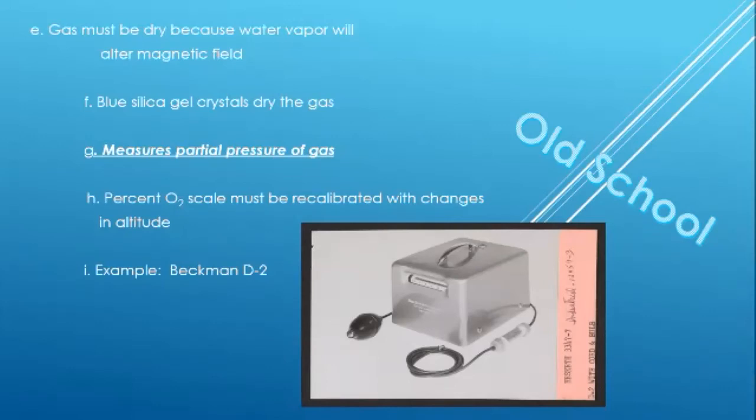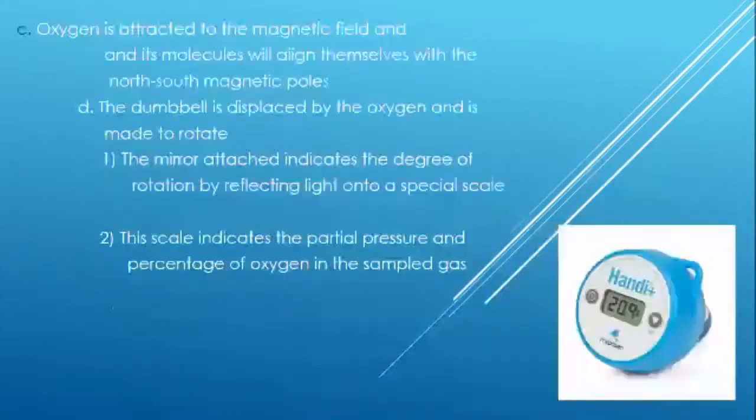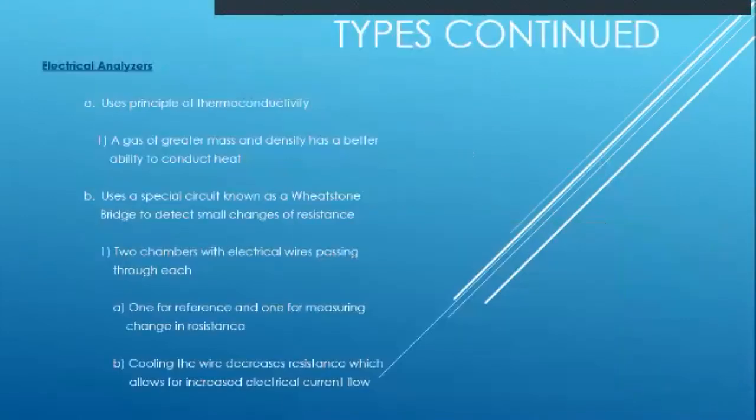That's the first one. The second one is electrical analyzers. This is the second type of oxygen analyzer. The electrical analyzers use a principle of thermoconductivity. Sophisticated as well. Look at what it does.